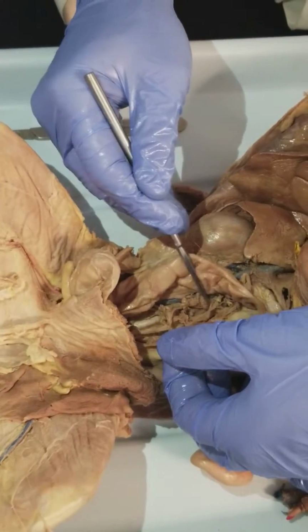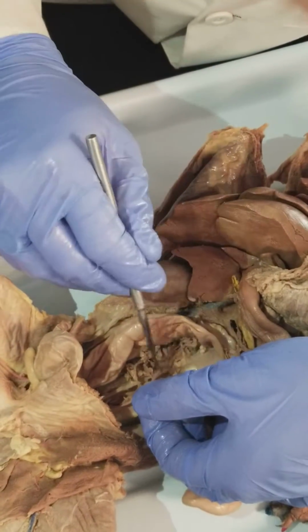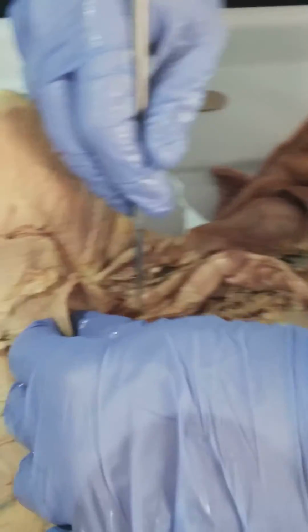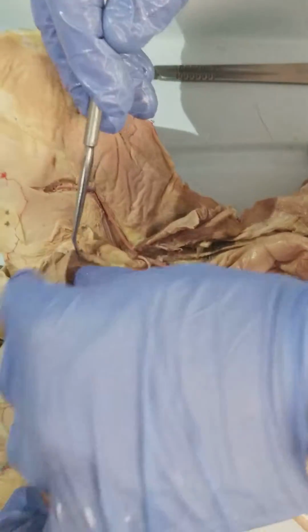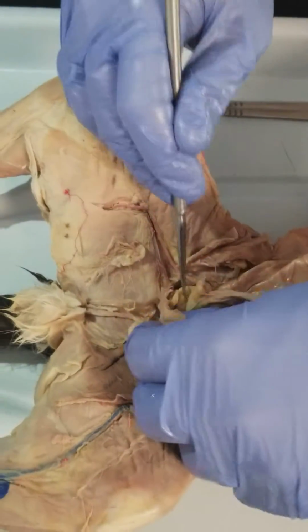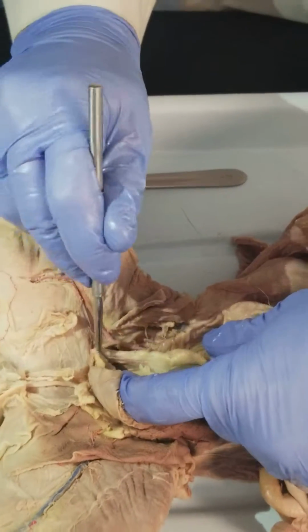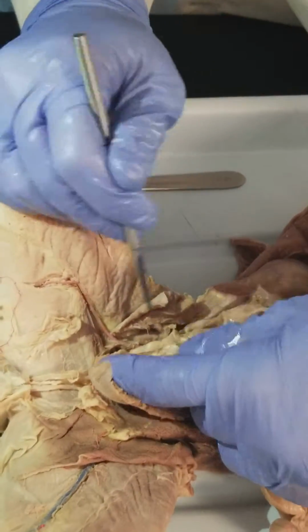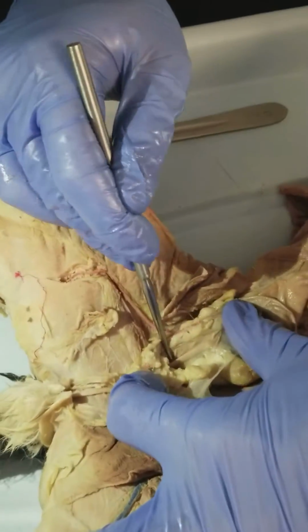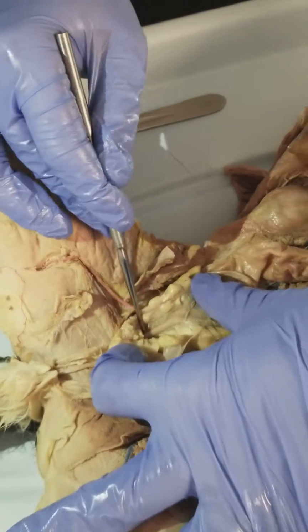That's the ureter. You can see it's going right up to where you'd expect the renal pelvis to be, right here on that medial side of the kidney. Okay. And you can see that's connecting to the bladder, which is this big pouch right here. Now if you take a look on the opposite side of the bladder, do a little bit of excavation here. Might have to get down in there a little bit. So here's the bladder, and then right there is going to be the urethra. That tube.